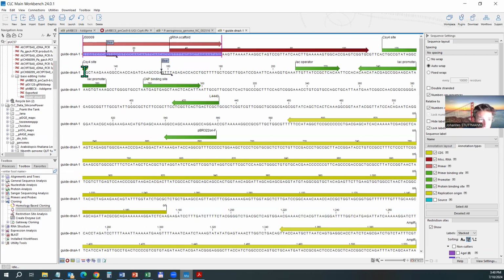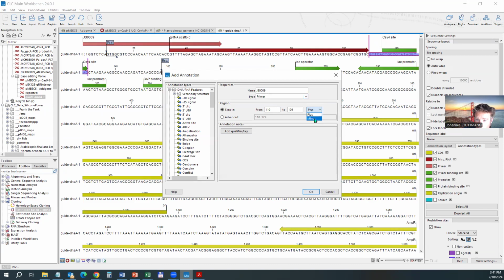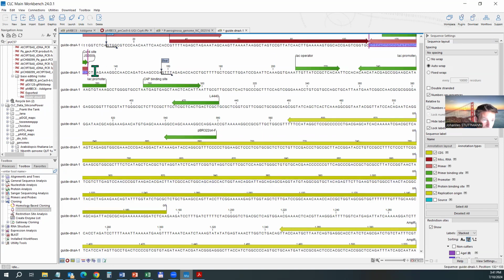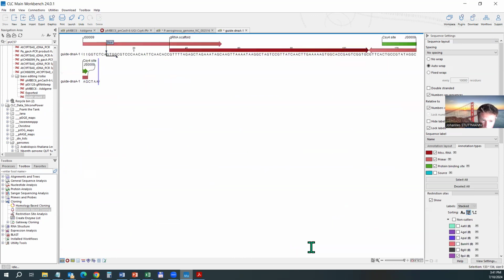And my PCR will run into this. So we have the CSY4 site, and now I need to make a reverse PCR primer. So let's say I can make it run until here. And these last 4 bases, I leave them now, as we can make a new overhang. All this is basically just vector backbone. It will not be part of our PCR product, so I delete it.